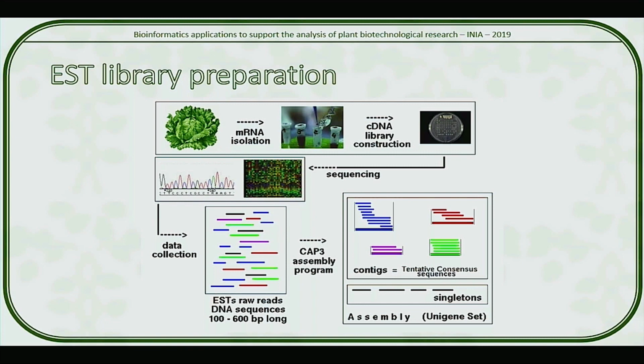Now, take into account that an EST library can have inserts of different sizes. Some genes are going to be small, some genes are going to be bigger, some genes are going to be fragmented because of the messenger RNA isolation method that we use, because of the chemicals we use during the isolation. Therefore, most of these EST libraries are going to be either fragmented or the sequence itself is not going to overlap even though they come from the same vector. That is because the gene is longer than the actual read length of a Sanger machine.